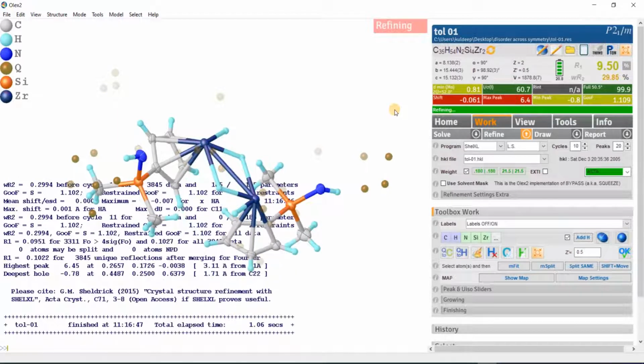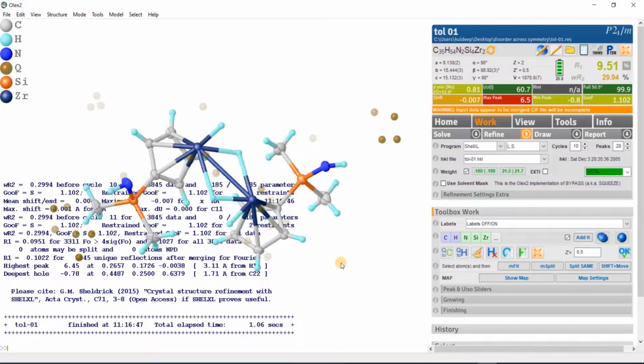Now, let's make the Q peaks a little bit larger for better visualization. For this, I am going to use this command, assuming 200 is the size of the Q peaks: $q. All the Q peaks are now 200 in size. Now these are looking better, good.